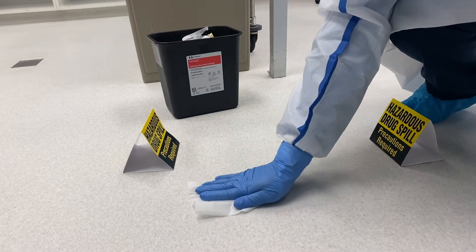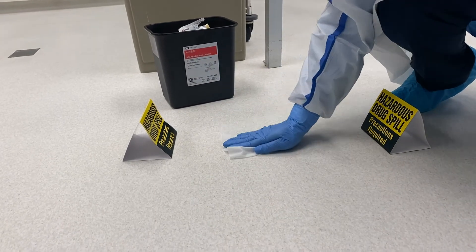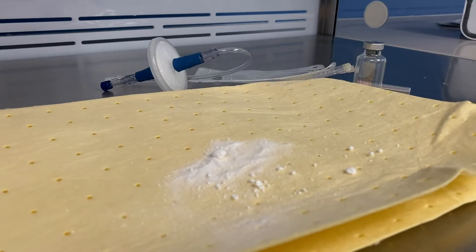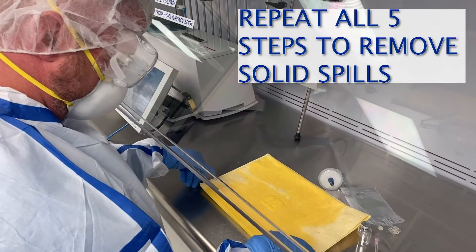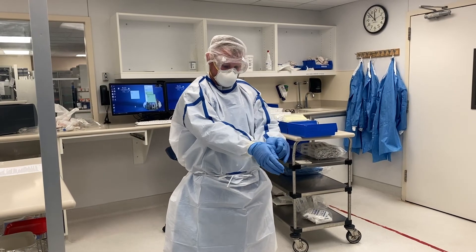Once the liquid and items have been cleaned up and disposed of, wipe the contaminated surfaces with a surface safe two-step applicator. Place the used surface wipes in the RCRA container. For solid spills, dampen the absorbent towels with a readily available water source and use the dampened towel to physically remove HD from the affected surfaces.